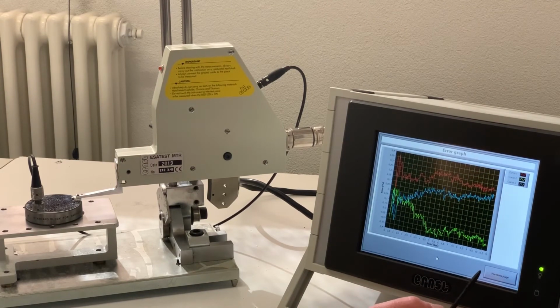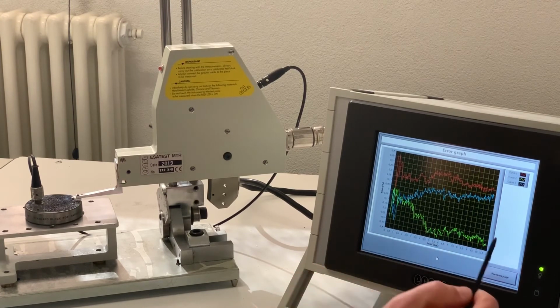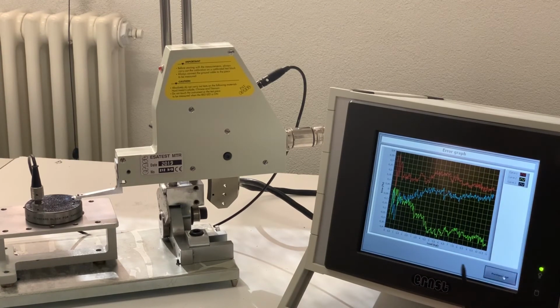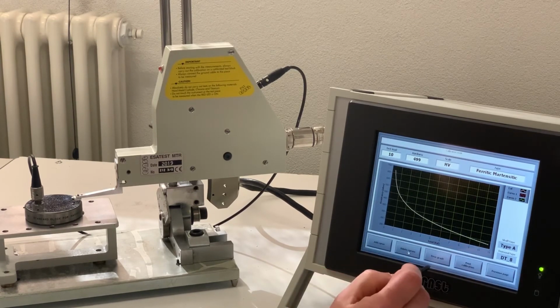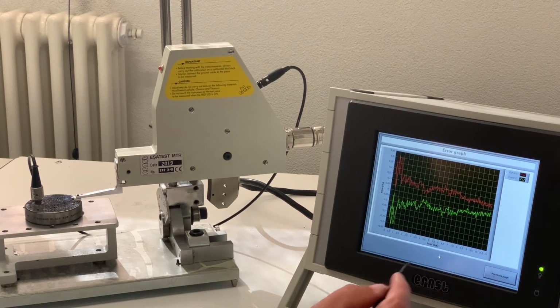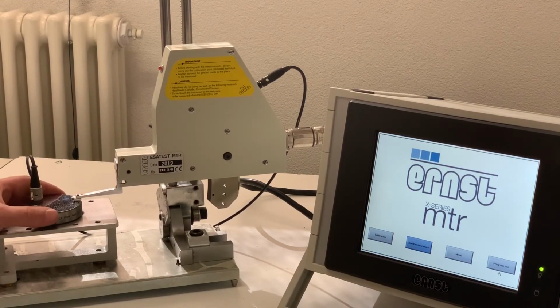Looking at the graph again, we erase the curve, which is the more distant one. So once selected, you erase it, and the 2 curves which are the less apart are the 2 curves that remain, and the instrument is ready, calibrated and ready to perform a measurement.